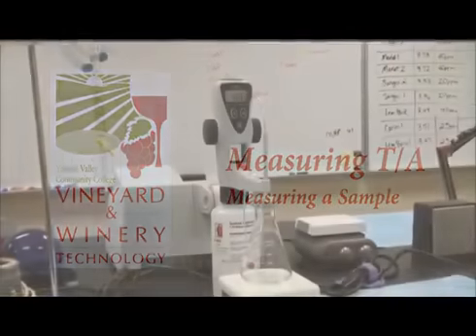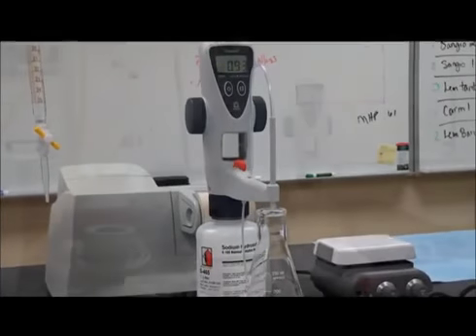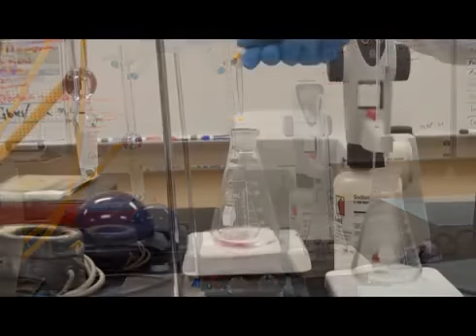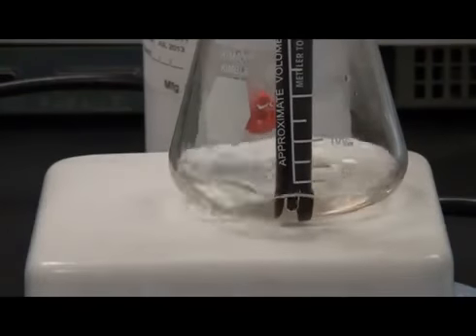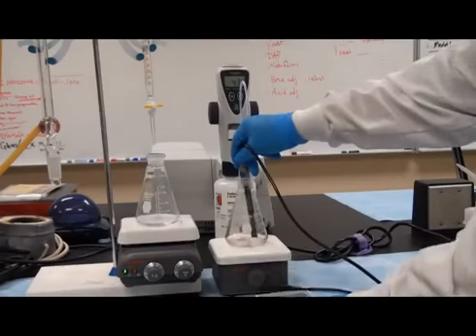Using either a digital titrator fitted with a 0.1 normalized sodium hydroxide bottle or a prepared 25 ml burette with 0.1 normalized sodium hydroxide, titrate the Erlenmeyer flask sample to a pink endpoint. Measure the pH of the sample as you near the endpoint of the titration. Continue the titration until an 8.2 pH endpoint is achieved.